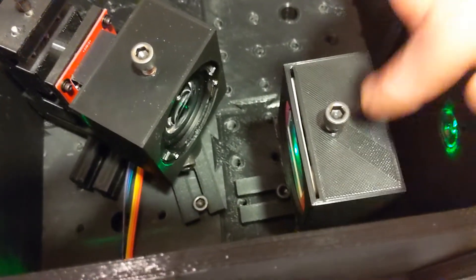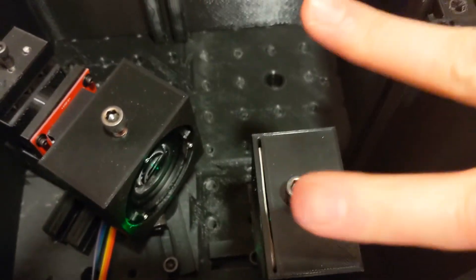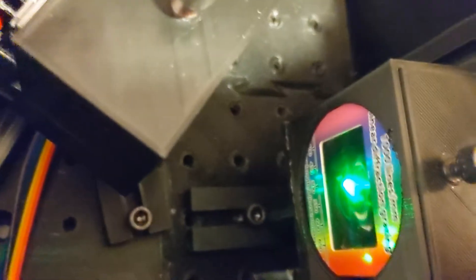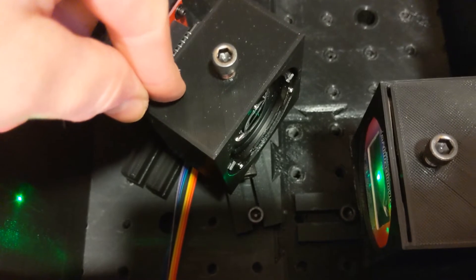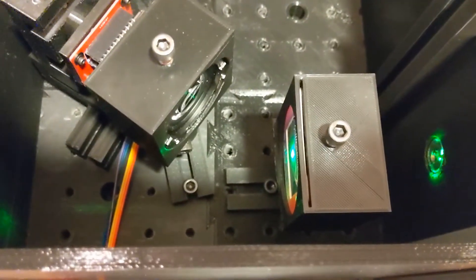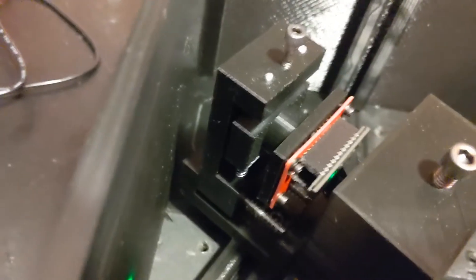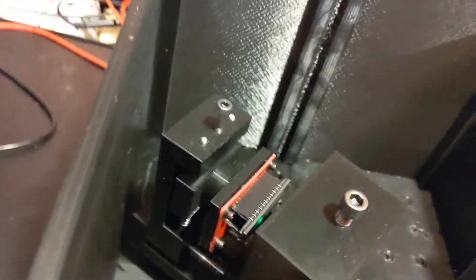Here is the collimating lens. The light is focused down to the slit, comes out diverging, then hits this lens and gets collimated. There's a diffraction grating right there — a cheap one I bought — and the light hits it, gets spectrally dispersed, goes on to the next lens still collimated, and then once it hits that lens it gets focused onto the CCD. It's all very modular: I can move both lenses and the CCD, and I made an XYZ translation stage for the CCD to get it in exactly the right position.